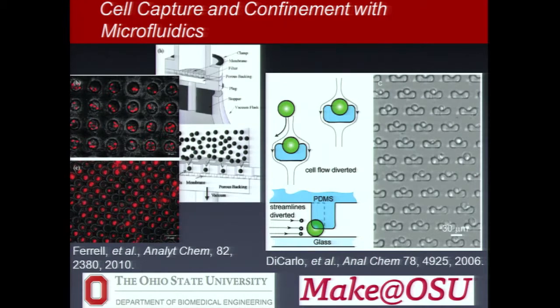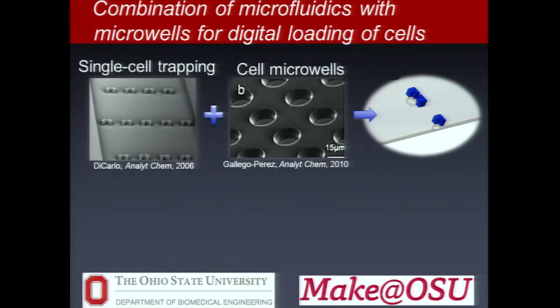Or we can look at, for example, non-adherent cells. We can hold non-adherent cells in a continuous culture and use that for studying their biology. Or we can combine these.